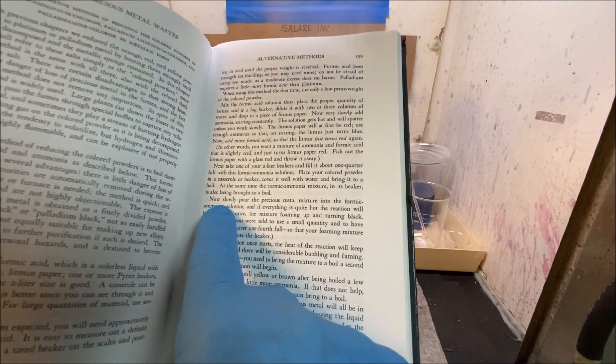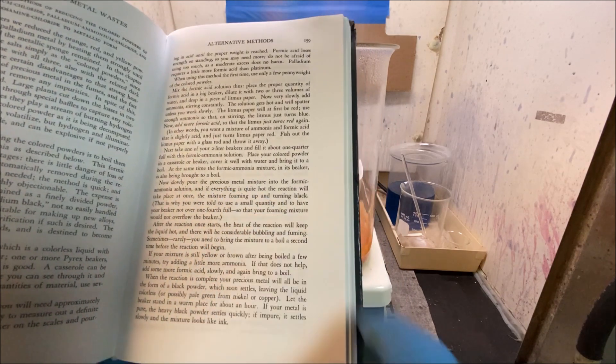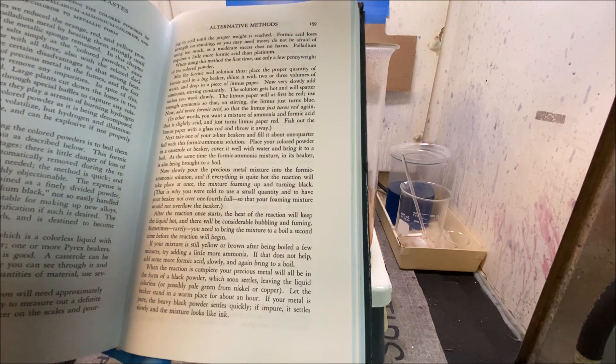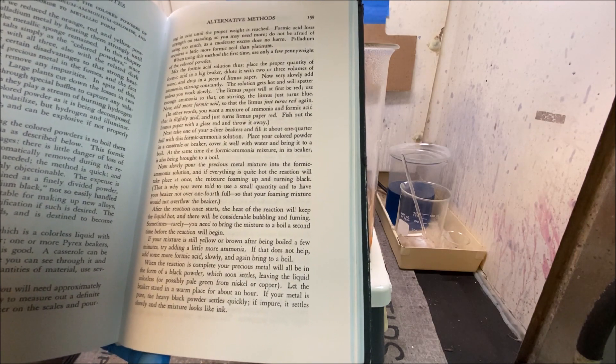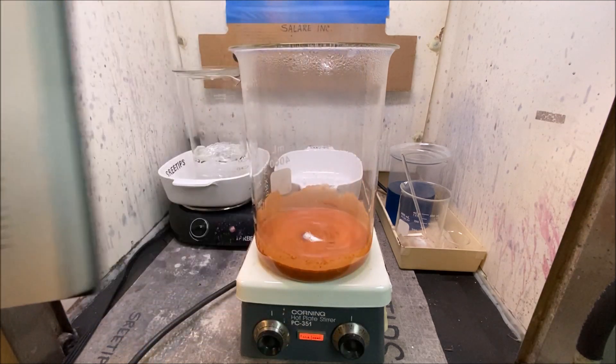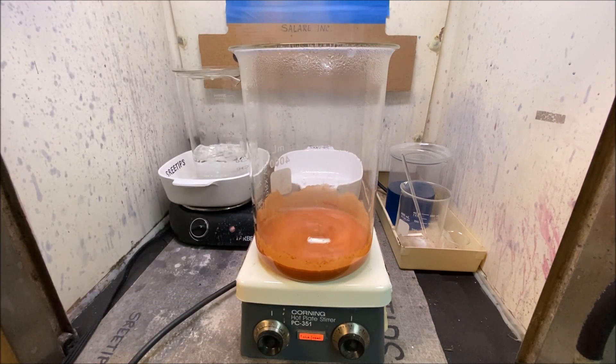If you look in the instructions, it says now slowly pour the precious metals mixture into the formic ammonia solution, and if everything is quite hot, the reaction will take place at once, the mixture foaming up and turning black.